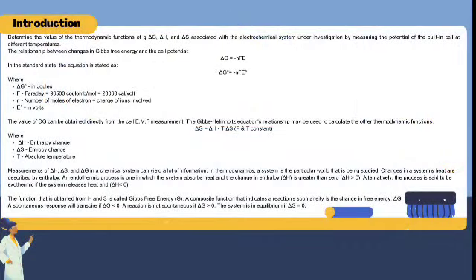Study of the relationship between chemical change and electrical energy is known as electrochemistry. A galvanic cell can generate electrical energy through a chemical process. On the other hand, a chemical reaction in a so-called electrolytic cell can be caused by electrical energy. This experiment is to determine some characteristics of the cell voltage.